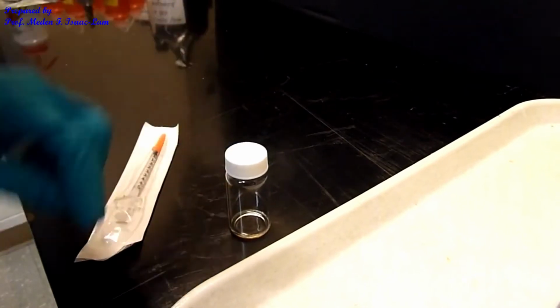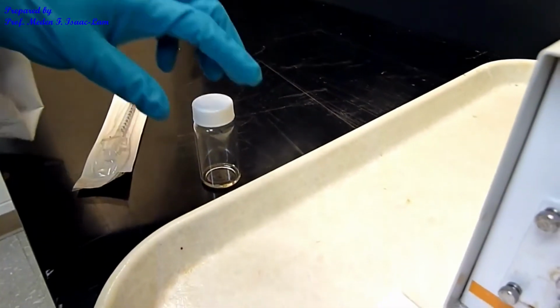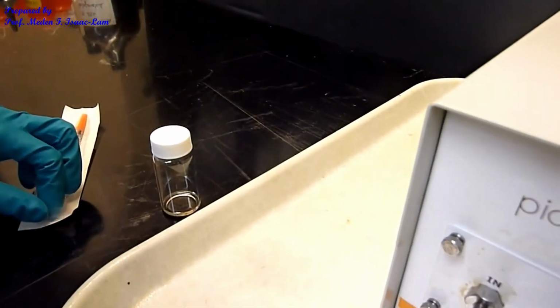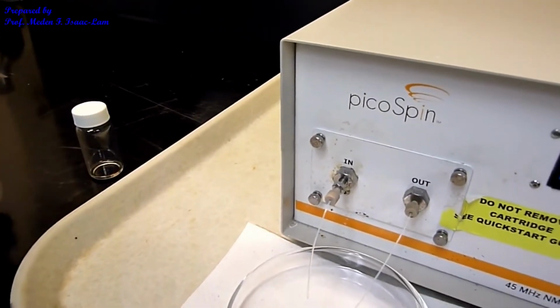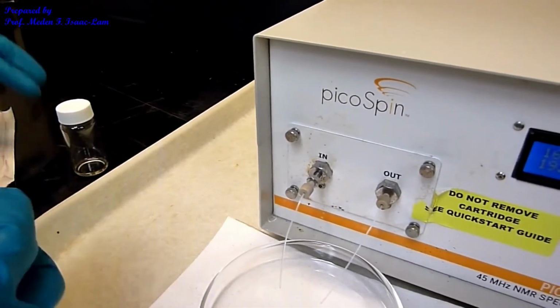We are now doing the analysis part of the experiment, and this is the NMR sample that I filtered. So it's filtered, it's just a liquid. I filtered out the solid byproducts, and then I'm now going to put it into the NMR instrument.